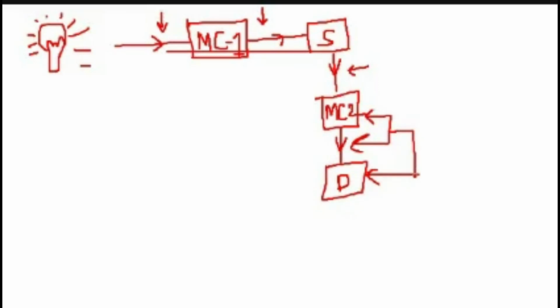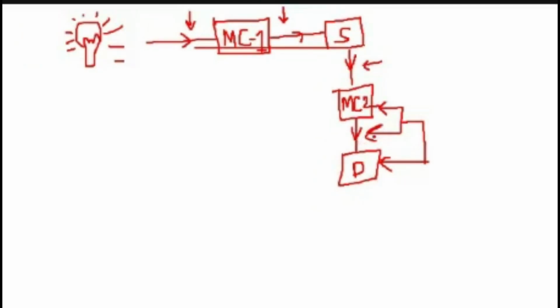It is getting measured by the detector. This intensity of wavelength that is coming from over here will depend on how much energy was absorbed by the sample. How much energy the sample is absorbing. The sample is not absorbing at all the wavelengths equally. It will have one wavelength at which it is getting excited at maximum.